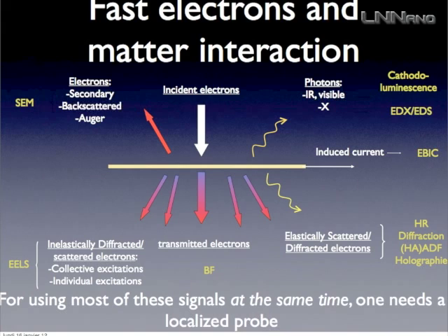So everything you do in TEM has to be understood in terms of a physical process that gives some change in intensity in some plane. I know it seems weird, but never forget that it's not really a reproduction of something that is really real. There are always a lot of hypotheses and assumptions.